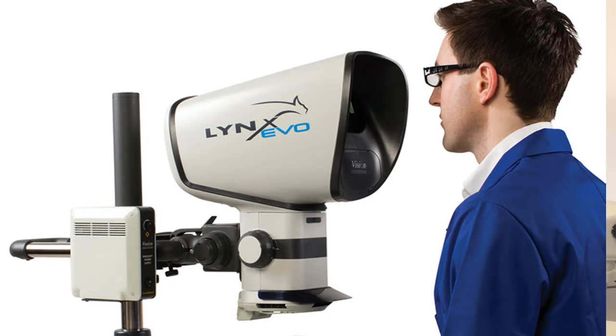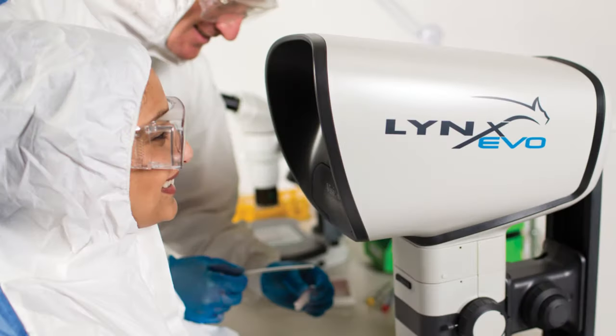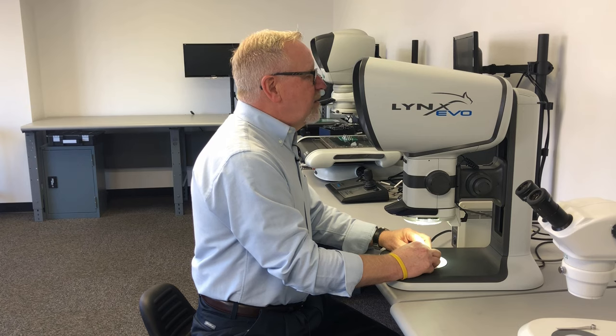We offer very large exit pupils for freedom of head movement, all while maintaining a high quality stereo image. Operators can work with corrective lenses or full face shields in hazardous environments. These features all yield greater operator comfort, which results in greater throughput.